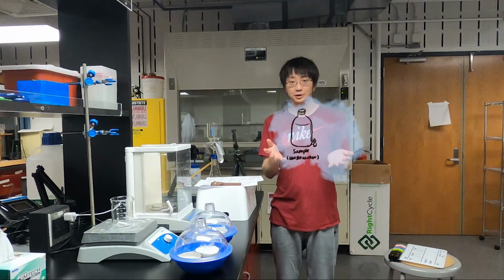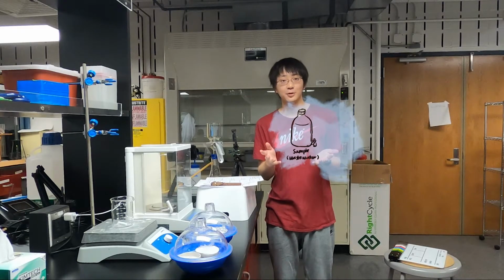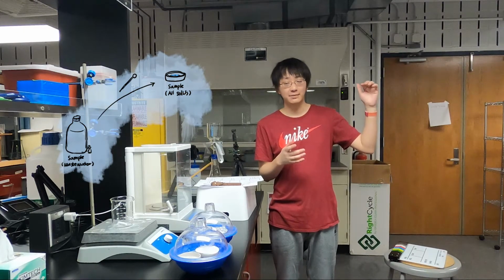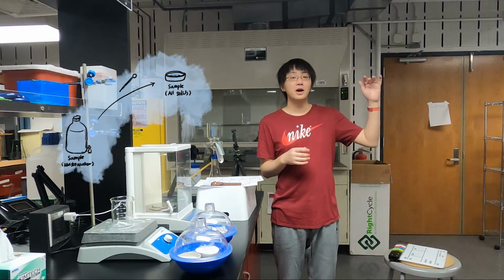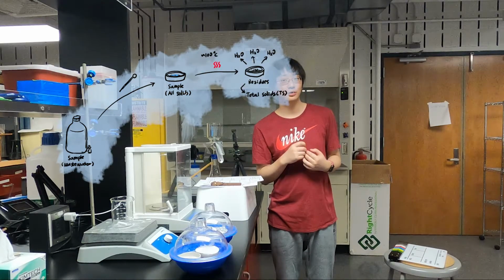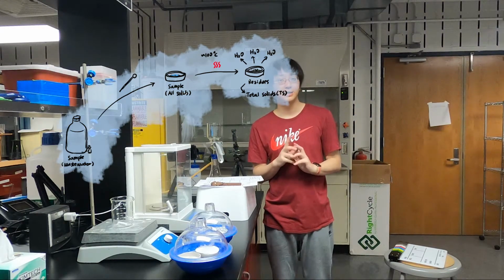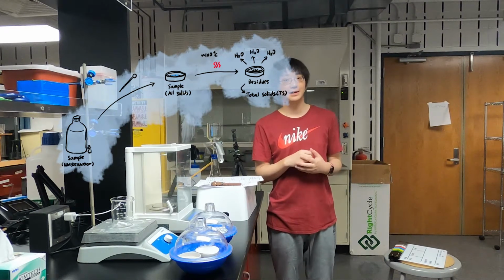Suppose we have a wastewater sample and we want to measure the solids content in this wastewater sample. So first, we can transfer some of the samples into a container such as an evaporation dish. For this container, we have all the solids in it, and of course, it contains water. So we bake this sample at about 100 Celsius degrees, and during this process, water gets out. And we have some residues in our sample, and these residues are called total solids, noted as TS.